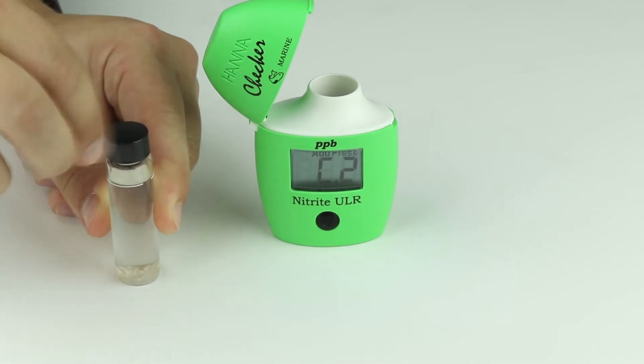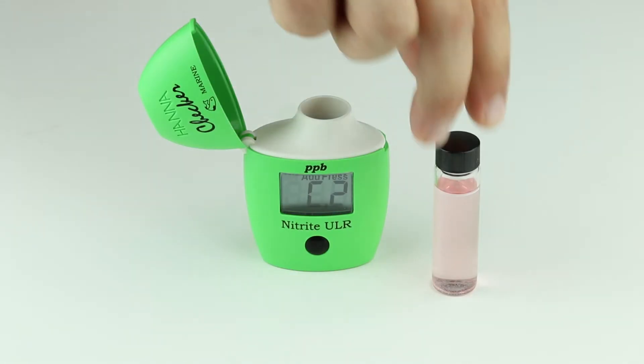Fasten the cap and shake gently for 15 seconds until the powder is completely dissolved. Wipe the cuvette of any oils and fingerprints and place it back into the meter.